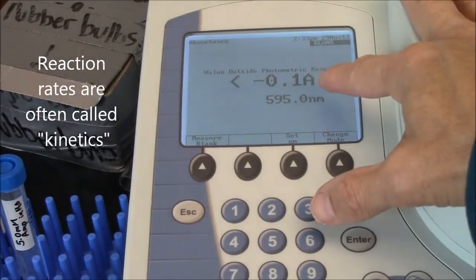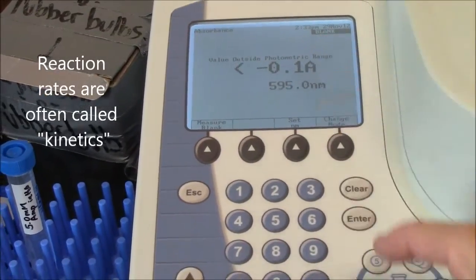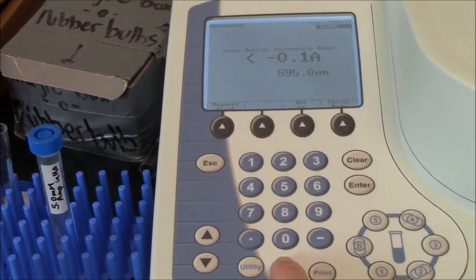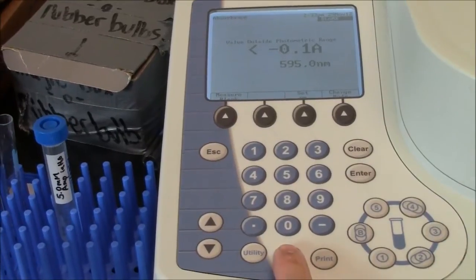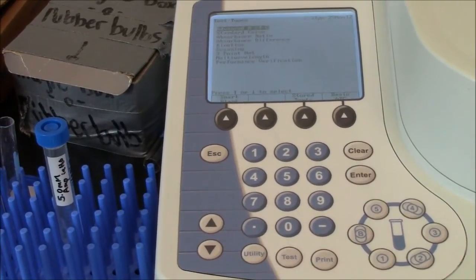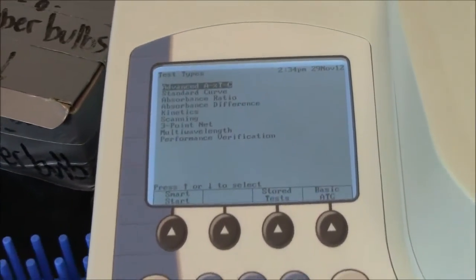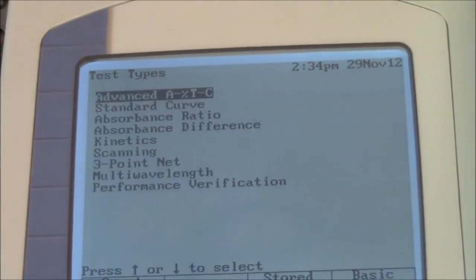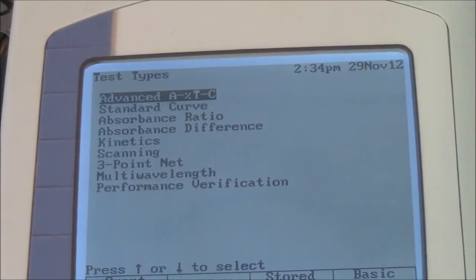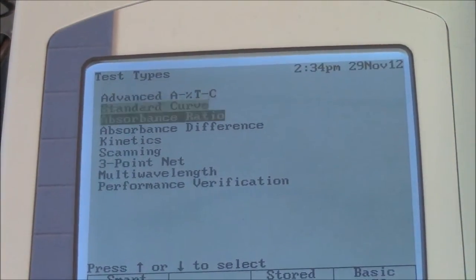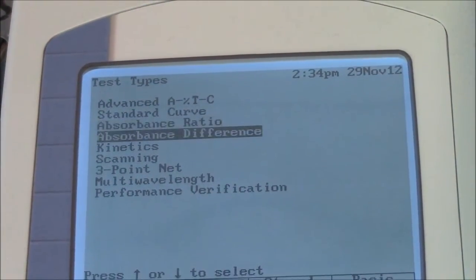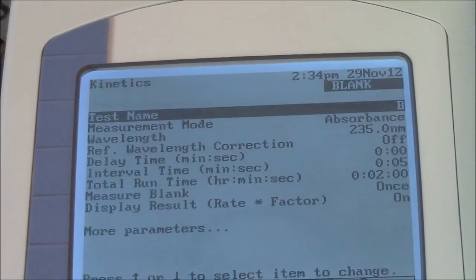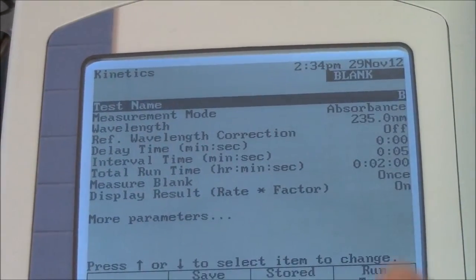To do a kinetics experiment on the Genesis, you need to get to the main menu. If you're not there already, press test. That will take you to this menu with many choices. For kinetics, the choice should be obvious — Kinetics. Hit enter to select that.